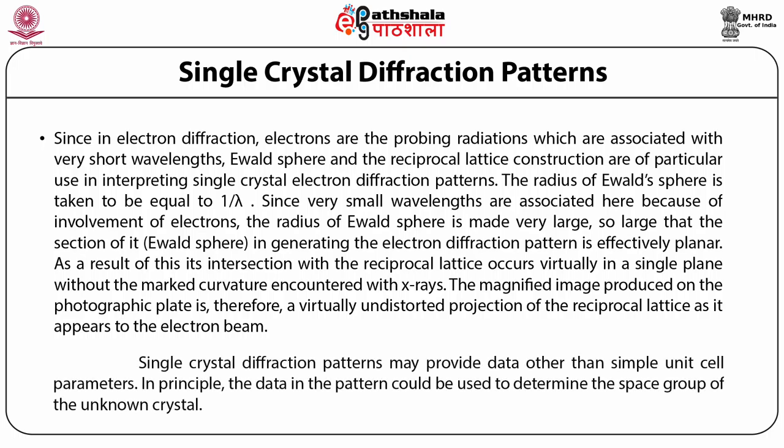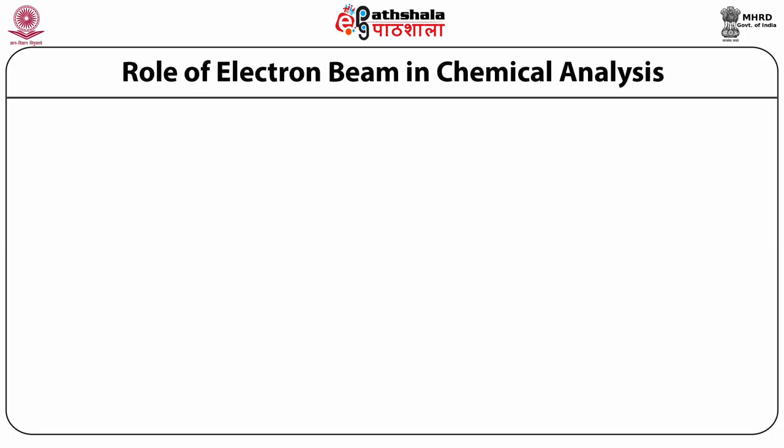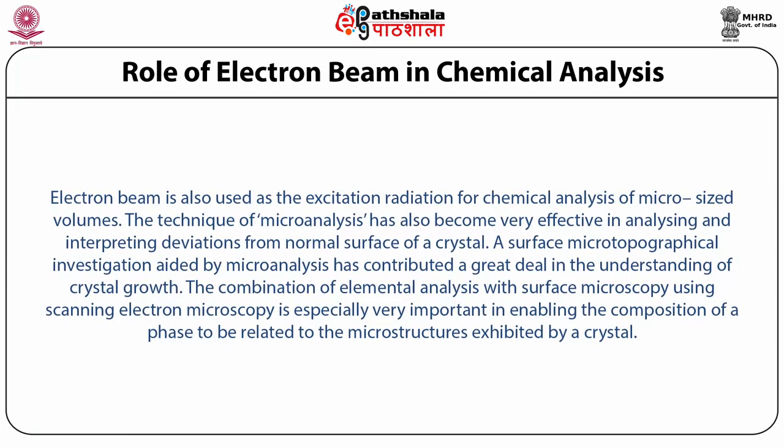Single crystal diffraction patterns may provide data other than simple unit cell parameters. In principle, the data in the pattern could be used to determine the space group of the unknown crystal. Now let us know about the role of the electron beam in chemical analysis. The electron beam is also used as the excitation radiation for chemical analysis of micro-sized volumes.